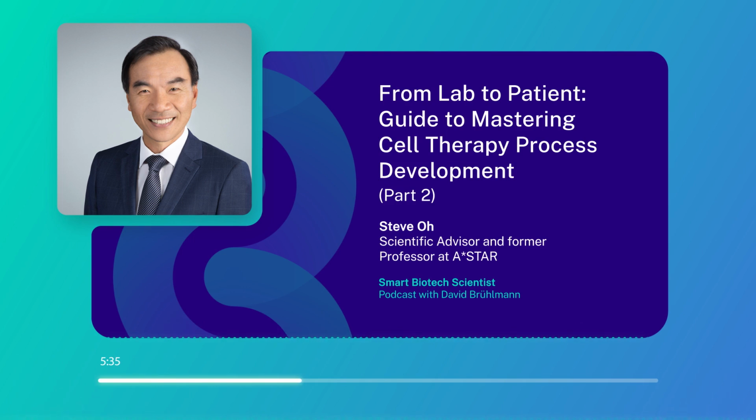But now you can stir away these aggregate cultures and they stay in the stem cell state. Then you drop in your differentiation solution and it becomes the next state. So we screened a lot of different microcarriers and found that a polystyrene-based one with the laminin was the best in keeping the cells in a stable state going into the bioreactor. And that was what we did in choosing solutions to go into bioreactors.